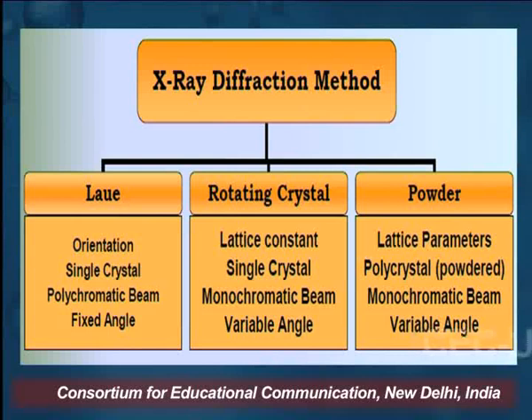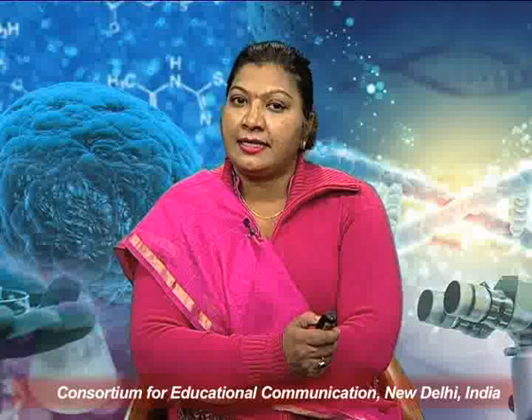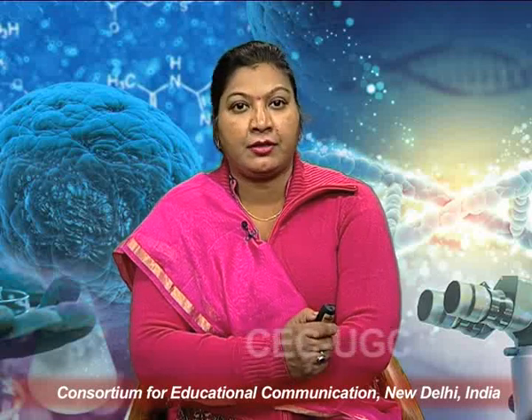It means the crystal is rotating through a 360-degree angle. So these are the common methods for the characterization of nanomaterial, to find out its lattice, its inner structure, or its defects. We can find it by using the X-ray diffraction method.